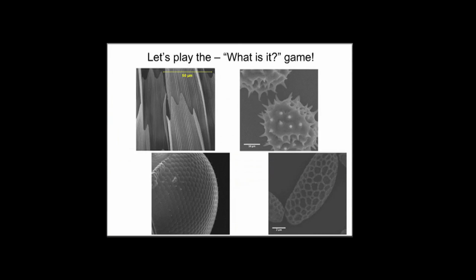And so to give you an idea, like Bob said, of what type of activities we can do, I wanted to start with some of our most basic activity. And this is what I like to call the "what is it" game. So maybe you don't have a lab in mind or a specific topic that you want to talk about, but you want to bring nanotechnology into the classroom just so students have an idea of what it's about.